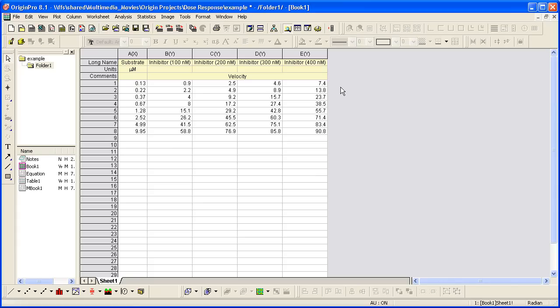The data from a fictitious assay is substrate titration for an enzyme in the presence of a competitive inhibitor at different concentrations. Let's go ahead and create a scatter graph.